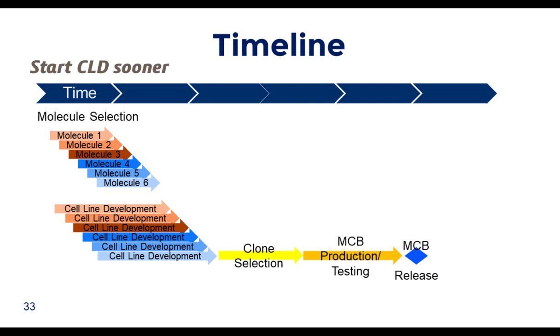With the ability to handle more clones and more plates, an automated process can provide the ability to prosecute more cell line development projects, as introduced earlier, potentially allowing initiation of cell line development prior to final molecule selection. This allows molecule triage to occur concurrently, so by the time a final molecule is selected, cell lines have already been developed. With more clones that are easier to handle, we have moved the start of cell line development back, off the critical path, producing manufacturing-ready cell lines sooner.